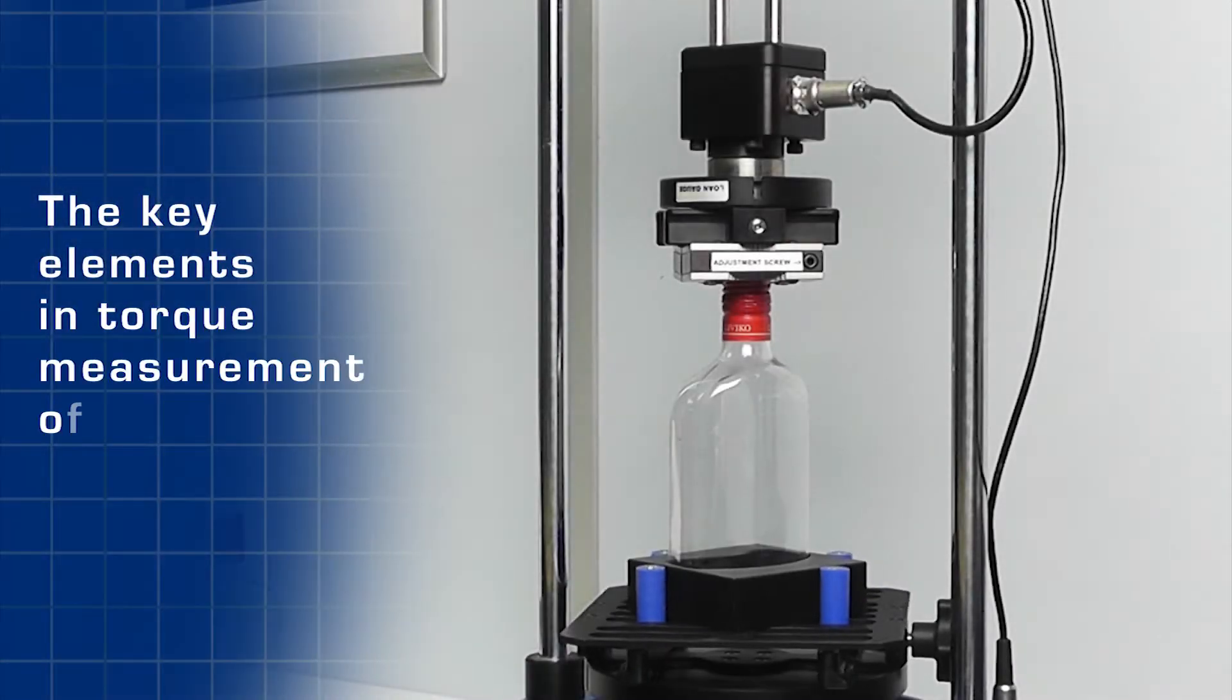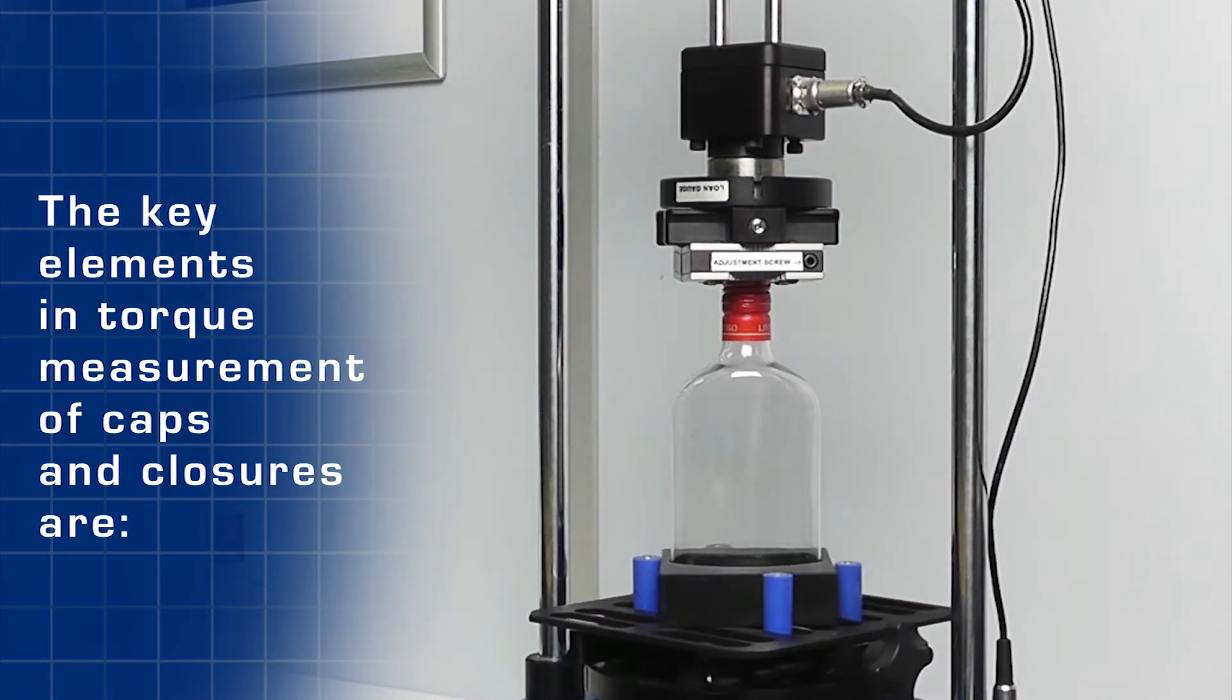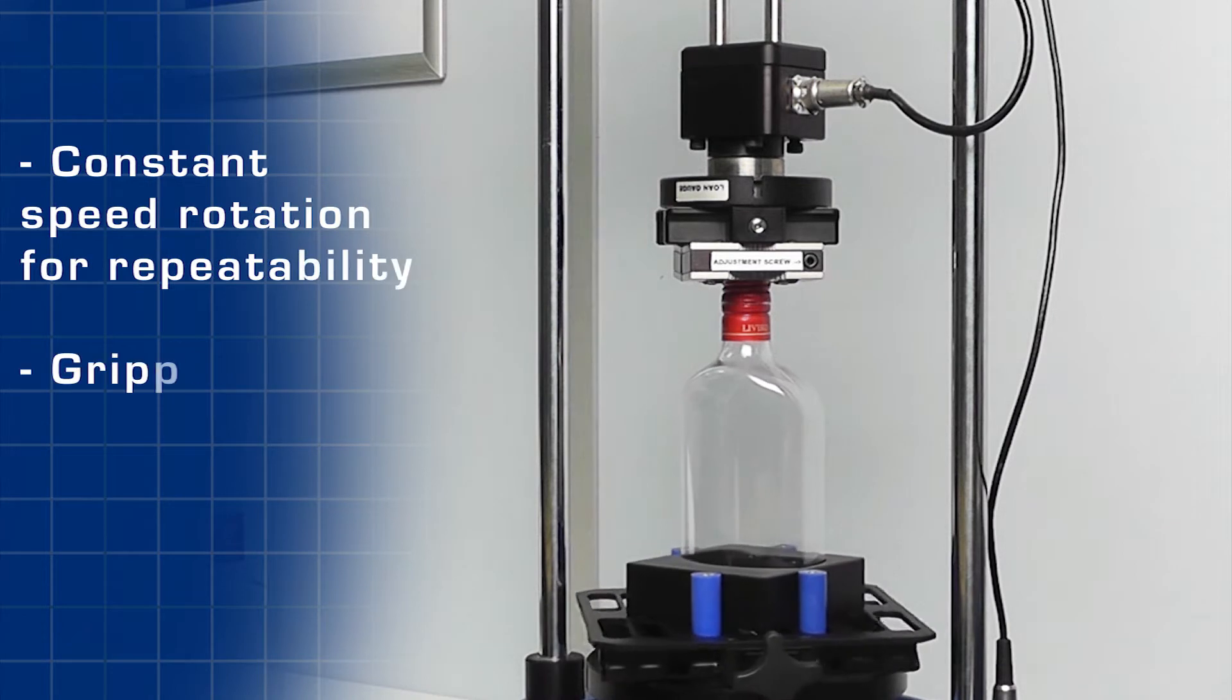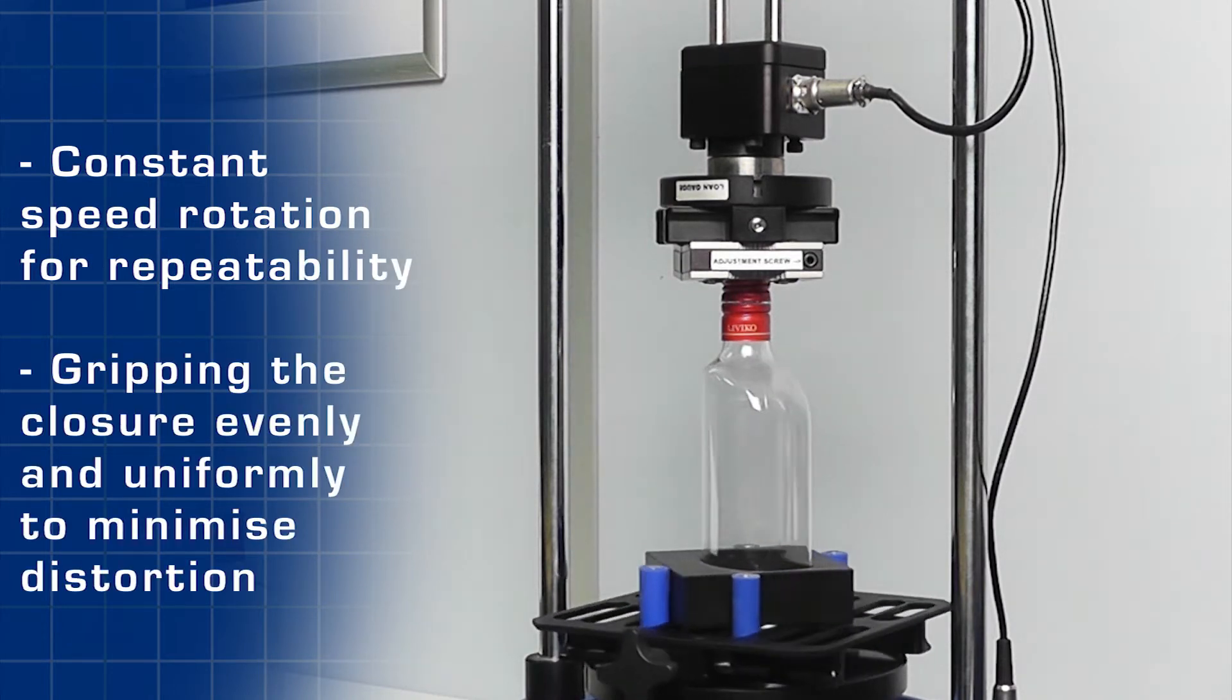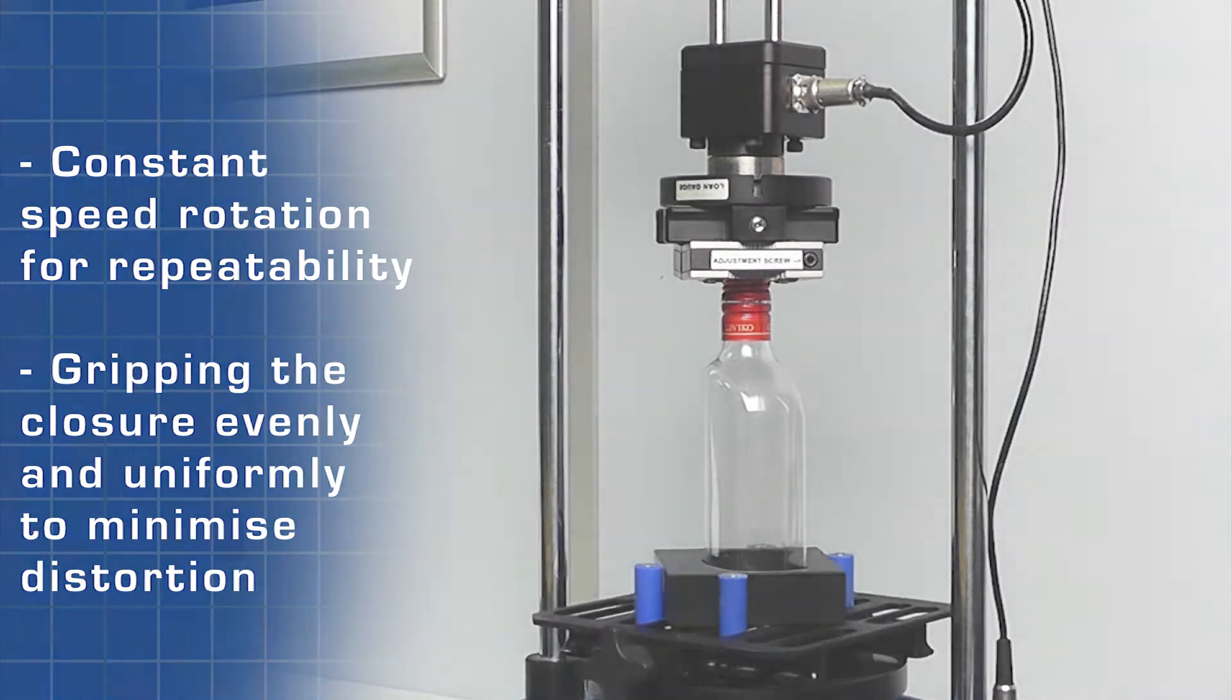The key elements in torque measurement of caps and closures are gripping the closure evenly and uniformly to minimize distortion, and constant speed of rotation for repeatability.